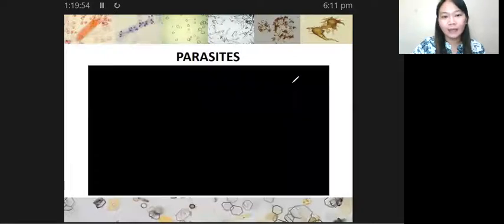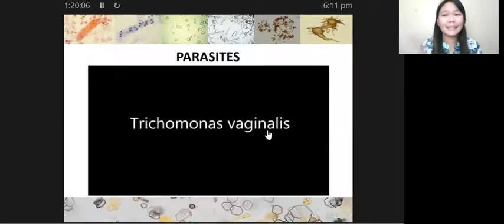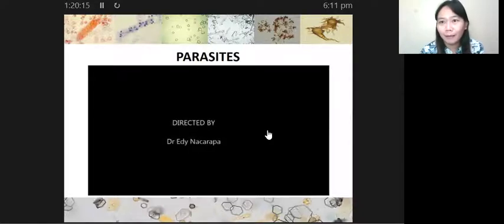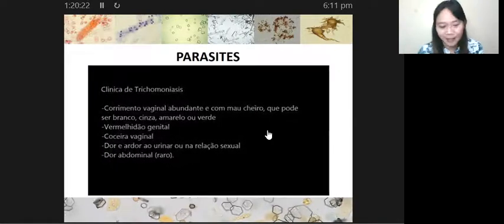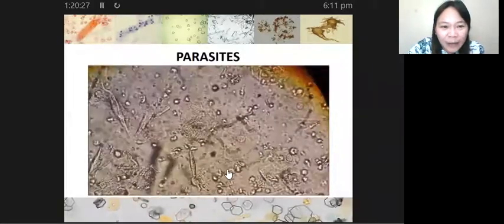Okay, so tignan naman natin ito. Ano ba itong video na to? I think this is the video of our Trichomonas vaginalis. Tingnan natin sila. They're really very beautiful under the microscope. But of course, we don't want to get infected. Ayan na sila, class.